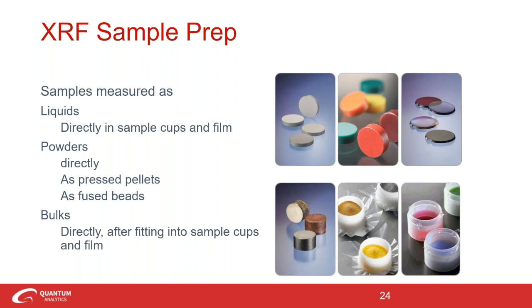So solids, right? For solids, you orient the surface patterns in the same manner so you minimize the scattering effects. So polishing surfaces will also minimize scatter effects. Flat samples are optimal for quantitative results. And for liquids, these samples should be fresh when analyzed, right?